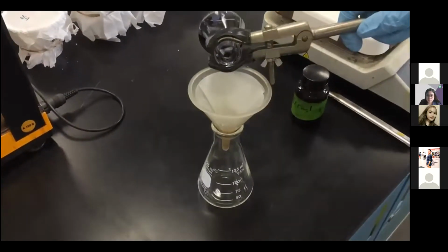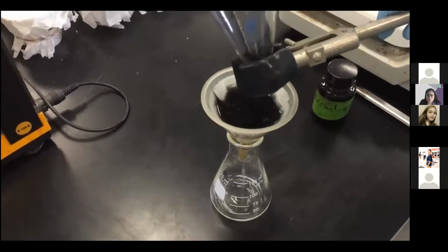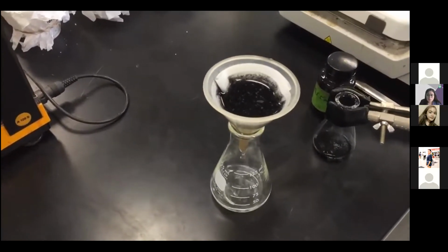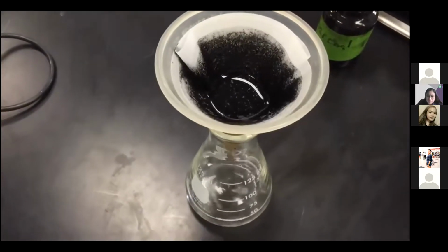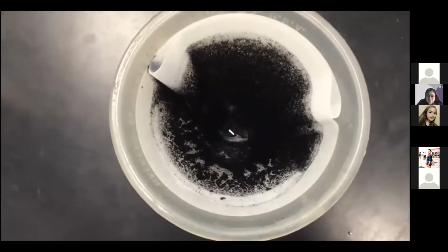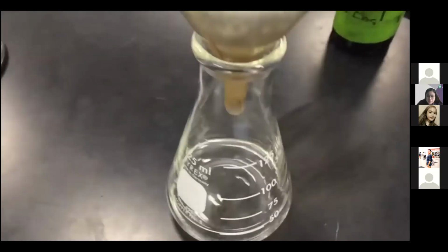Using the clamp, pour the solution in the center of the filter paper set up for gravity filtration. Due to rapid cooling of the solution, precipitate may form in the funnel. If this happens, add hot water to the center of the filter paper.